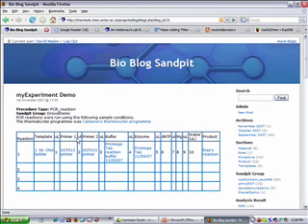The classic problem with recording data in any form, whether it's a LIMS system, a database, or anything, is persuading people it's worth putting any metadata in. Unless it's very, very easy, there's an issue with that. Additionally, we've got this problem with creating tables, and the problem of doing the linking. All these things are just a little bit difficult. What we want is to make all of that easy so that people do it automatically.